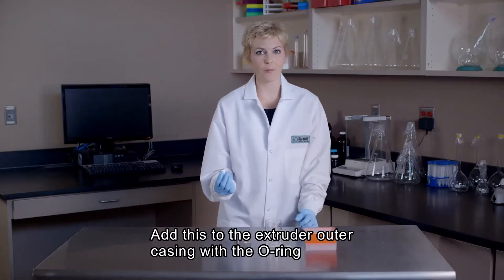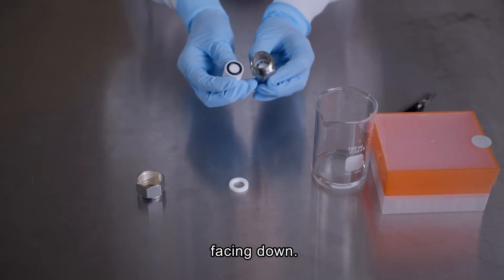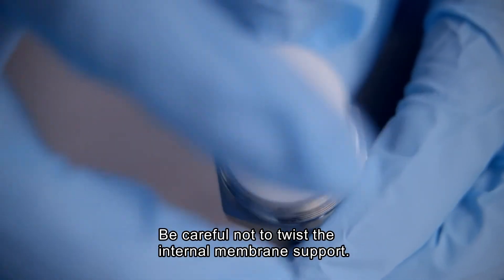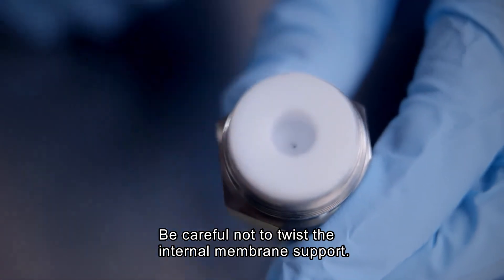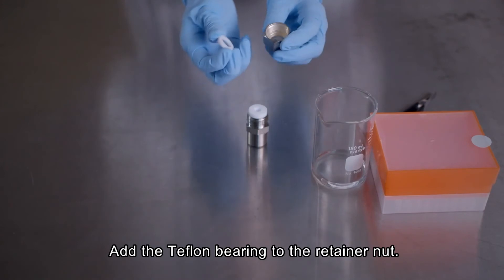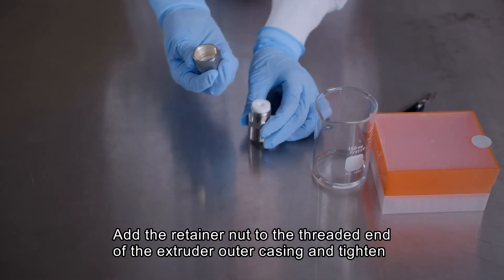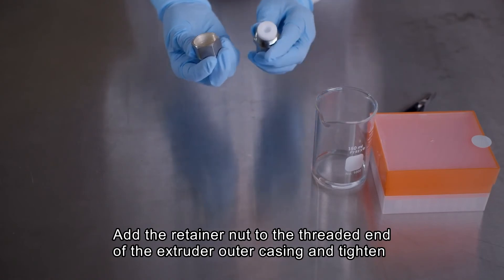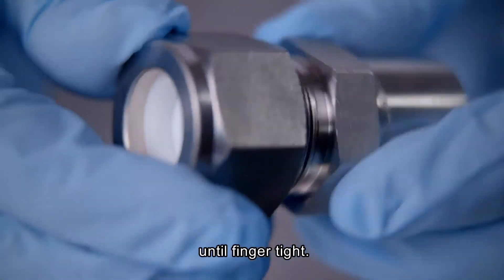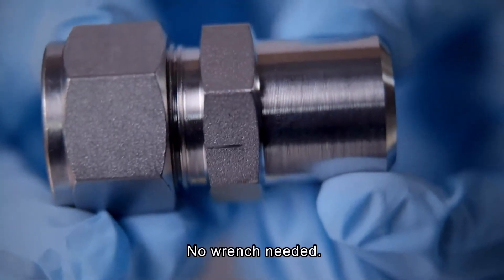Add this internal membrane support to the extruder outer casing, this time with the O-ring pointing downward, being careful not to twist the internal membrane support as it comes in contact with the polycarbonate membrane. Then add the Teflon bearing to the retainer nut, and finally add the retainer nut to the threaded end of the extruder outer casing and hand tighten until finger tight — no need to use a wrench.